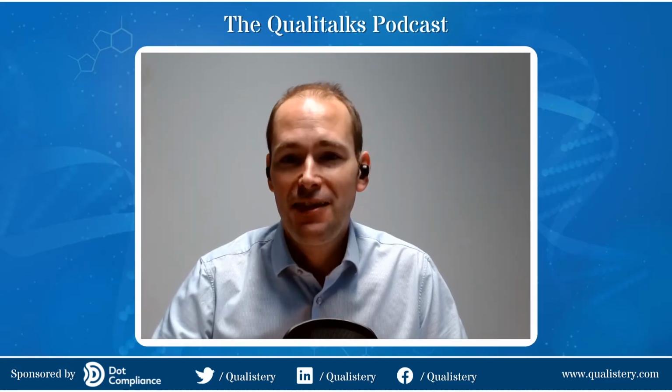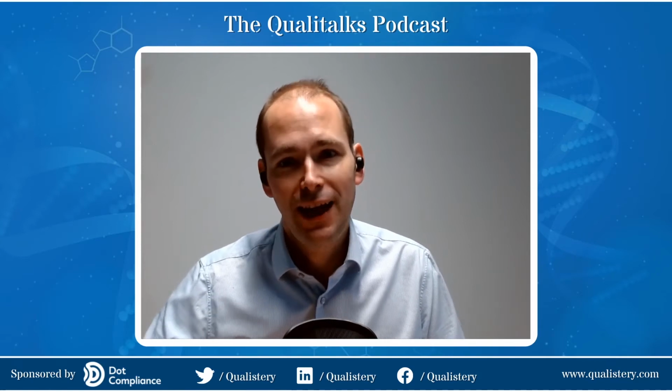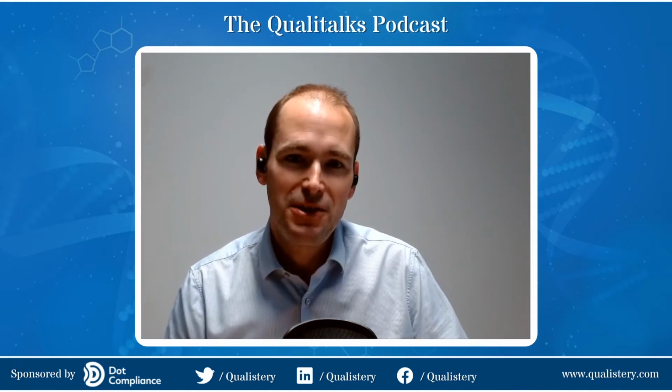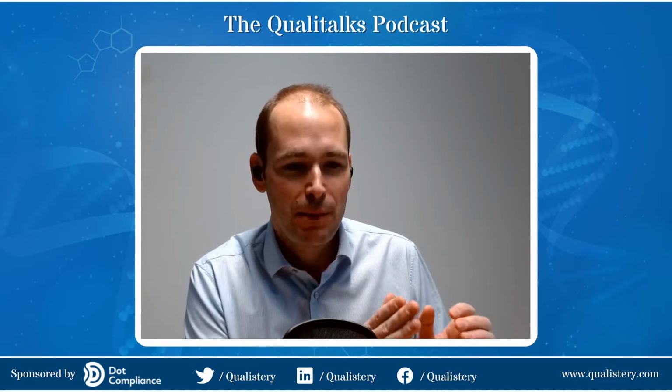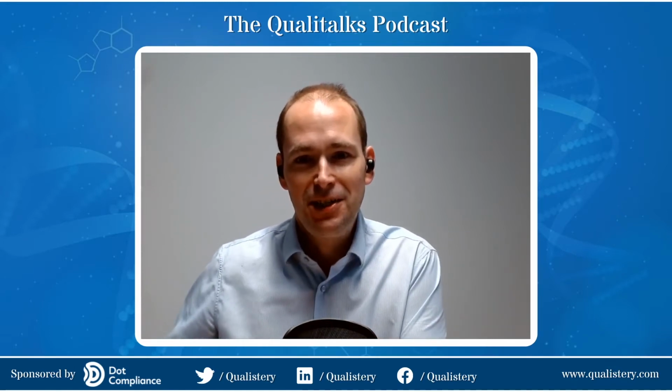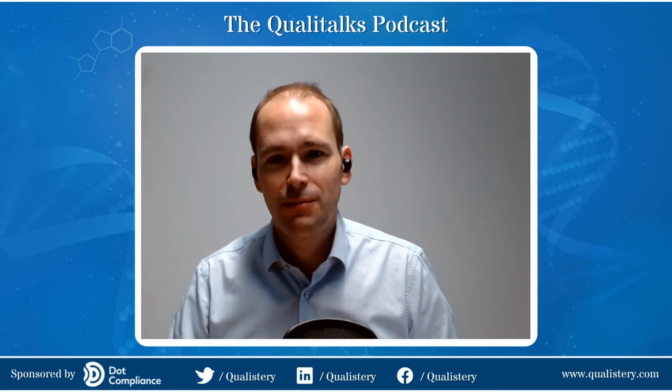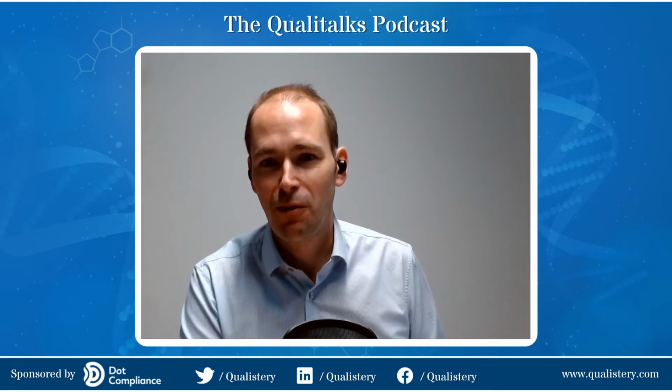Right. So it means that you probably should have engineers and experts that really understand how the physics works. Absolutely. Yeah, I'm a big advocate of bringing in validation as early as possible, and engineering, because these are the guys that work on the machines. They probably already work with them in your facility and they understand how they work. They understand some of the issues that we're likely to face further down the line. It's a strange issue, but if we can iron those issues out initially, an extra couple of weeks' work at the URS stage will result in far fewer issues in the future for ongoing production. And it'll allow you to use that autoclave continuously with less downtime, because you won't be seeing some of the issues because you spec'd it correctly from day one.